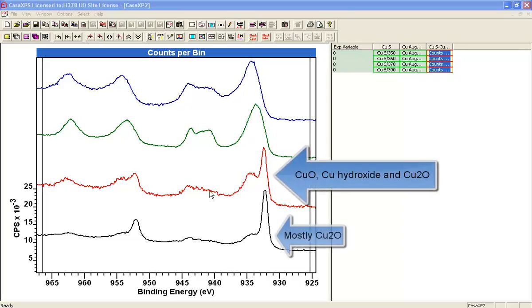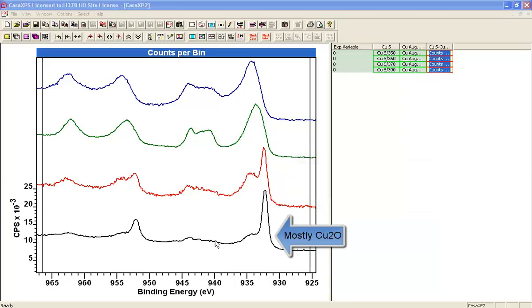And we've got one here that, well, may well have a hydroxide component with a 1+, and this one here has some kind of oxide. Well, that's consistent with the structure here, but is predominantly a 1+.